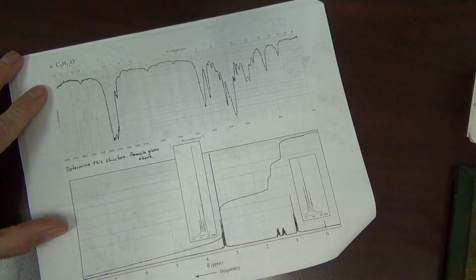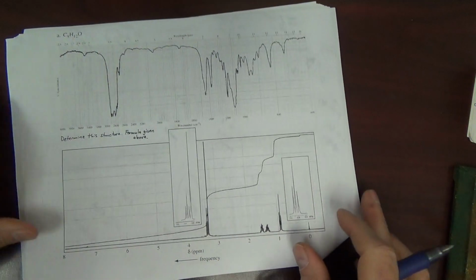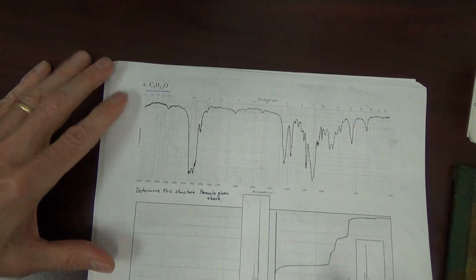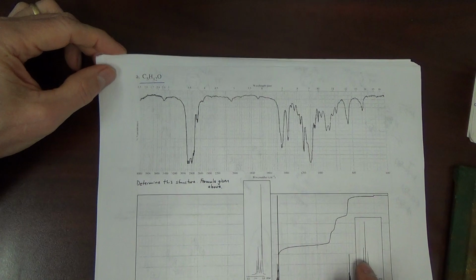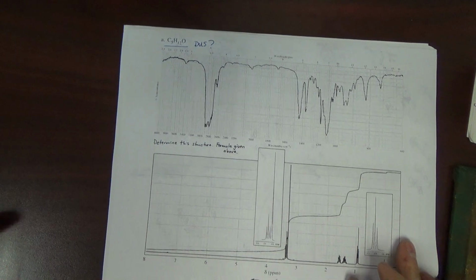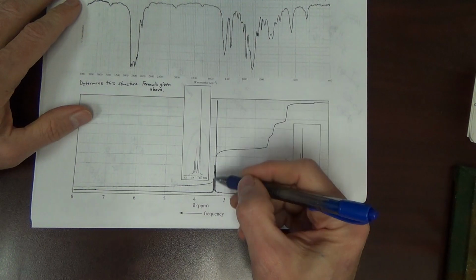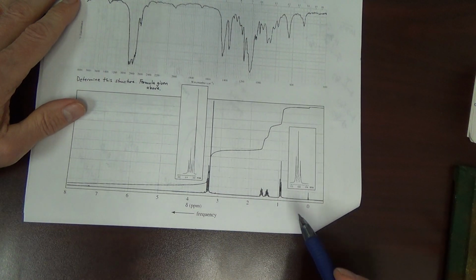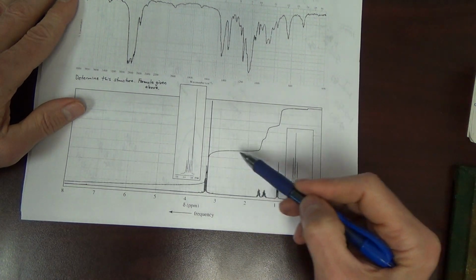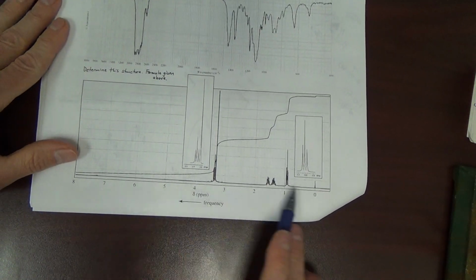I'm tempted to ask you to do this one on your own, because it's the last one before we move on to carbon NMR. Okay? Give you a chance to do this one on your own. Formula is given. Somebody is very kind. I would start with DUS, so we can get an idea of how many rings or something there. All right. You're going to have to determine your integration. That is the relative integration of your signals, all right, using this integral line, IR. And see if you can come up with structure.